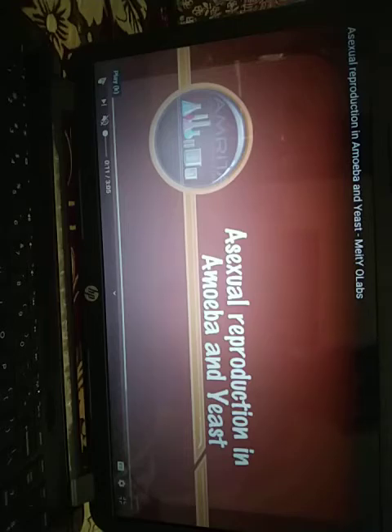Hello students. Today in this video we are going to discuss asexual reproduction in amoeba and yeast, and there is one experiment in your syllabus in which we have to study asexual reproduction in both through a slide. So what are the various steps, what is the material required, and what is the observation that we are going to discuss in this video.